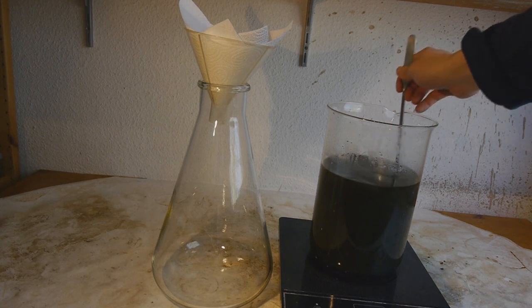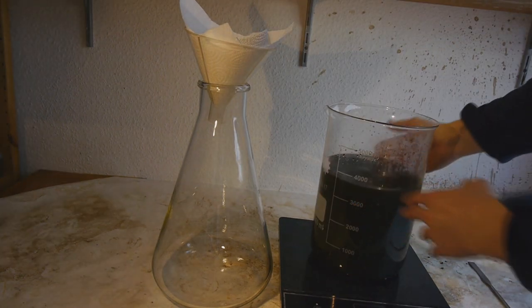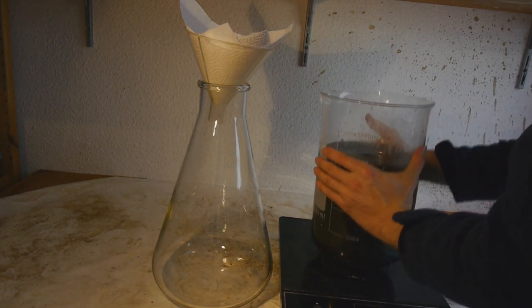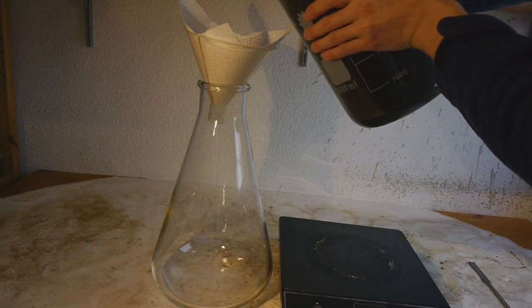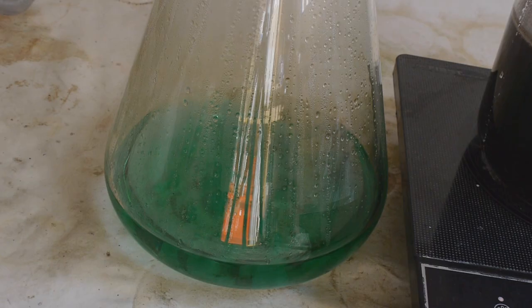And now we can filter the solution through this piece of paper. The solution isn't actually very hot. Warm to the touch only. This might take a while. After an hour of filtration, this is how much I get. This is only about a liter of filtrate.